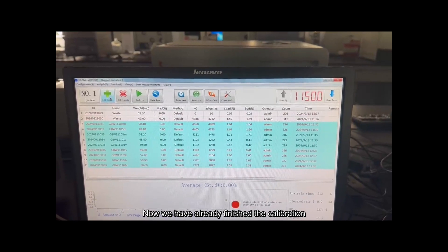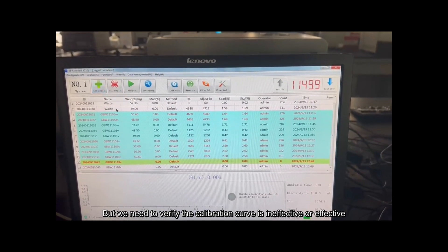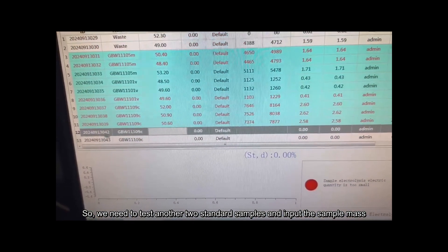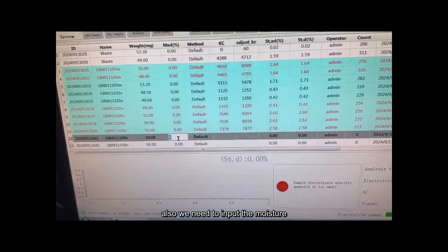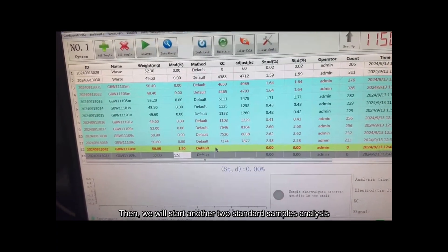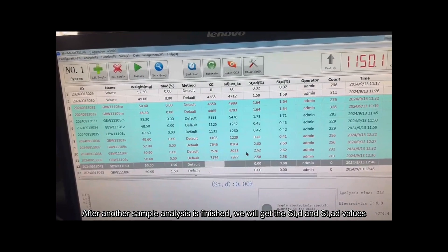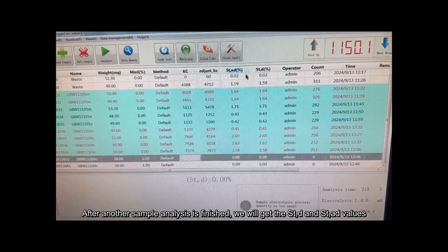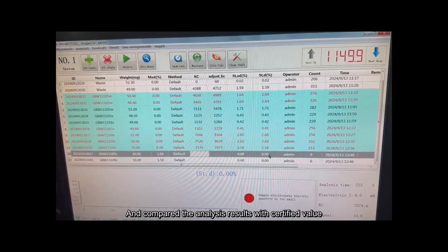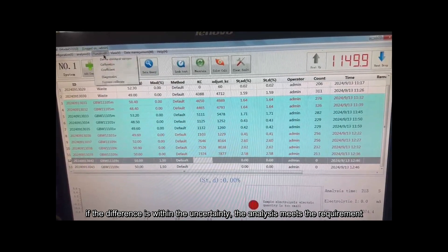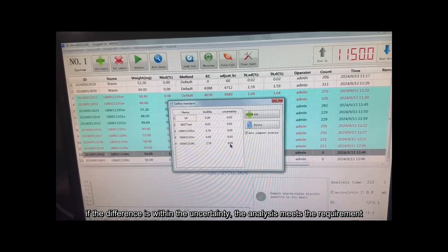Now we have finished the calibration, but we need to verify whether the calibration curve is effective. We need to test another two standard samples and input the sample mass. We also need to input the moisture. After the sample analysis finishes, we will get the result called ST — sulfur on a dried basis — and compare the result with the certificate value. If the difference is within the uncertainty, the analysis meets the requirement.